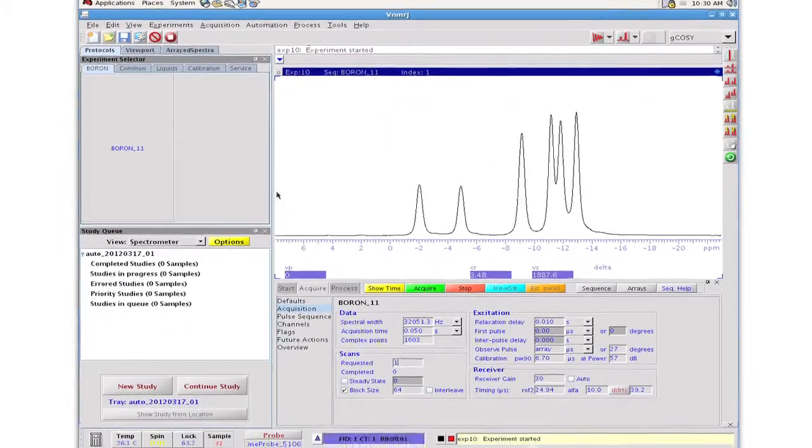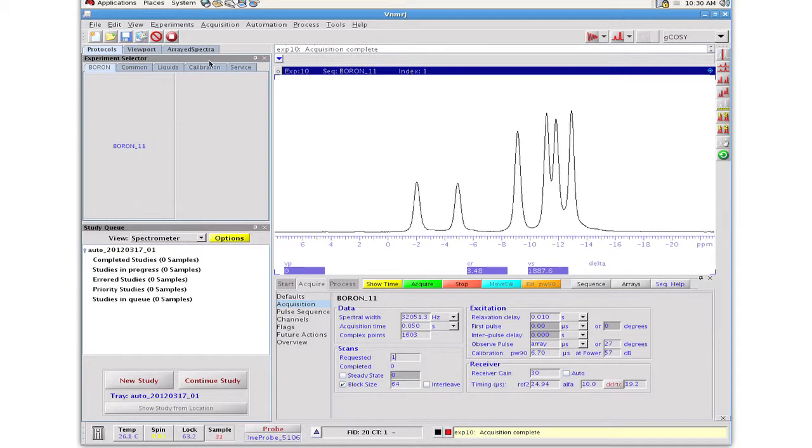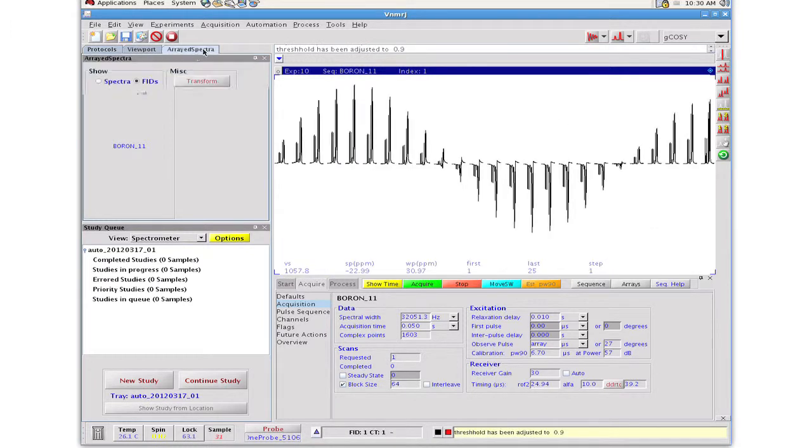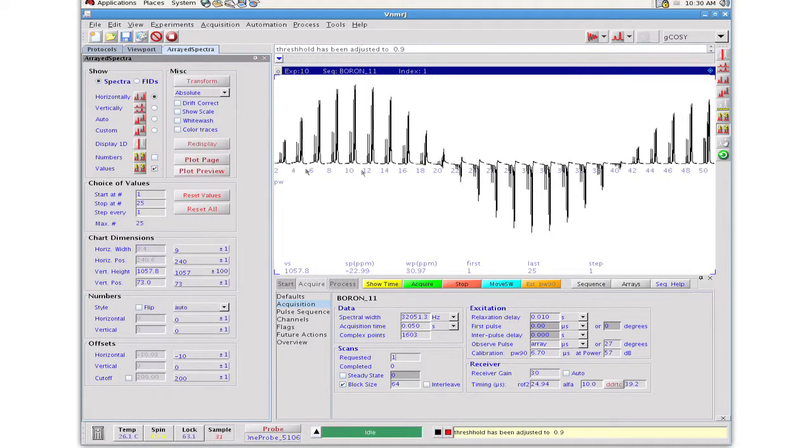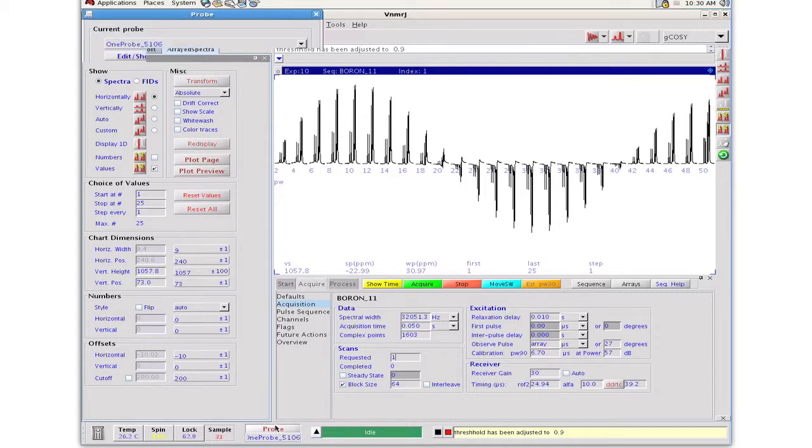The second null appears at 40.4 microseconds that corresponds to a 10.1 microsecond 90 degree pulse width at a power level of 57 dB. This information is probe related, so it should be stored in the probe file.